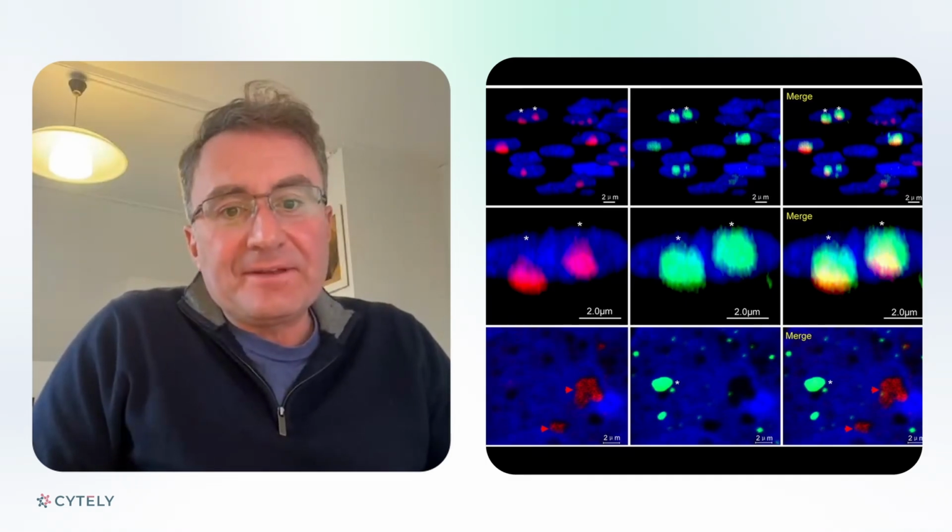Once we were introduced to Cytely, for what I said, it took 5 years to figure out the design of this. There was lots of struggle. We were transfecting the cells, and the efficiency of transfection is rather low. Then we were infecting those transfected cells, and the efficiency was even lower. So we had very few cells that were both transfected and infected at the same time, and really had no understanding and appreciation of numbers.